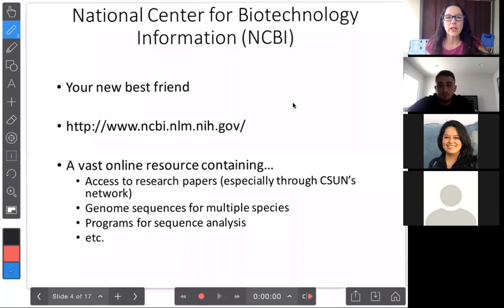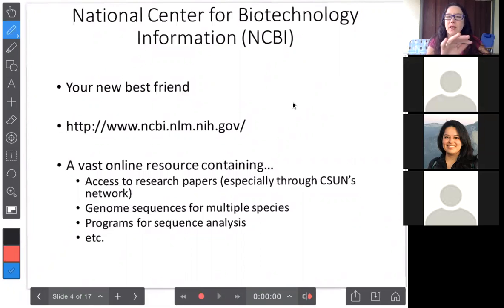Okay, so we're going to use the NCBI website. If you want to, you can turn off your cameras and you don't have to have the Zoom up front, so you can switch tabs back and forth. I'm going to walk you through it and there are some screenshots, but I want you to be logging in to this site, following along, and making up some gene name or doing the ones that we're doing on here, just to make sure that you can recapitulate these steps on your own with whatever gene you end up choosing. You don't have to go quick and find a gene.